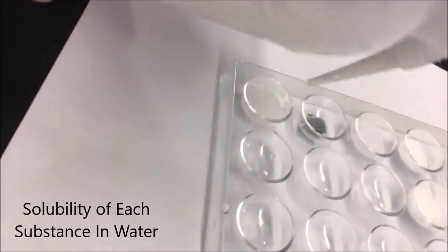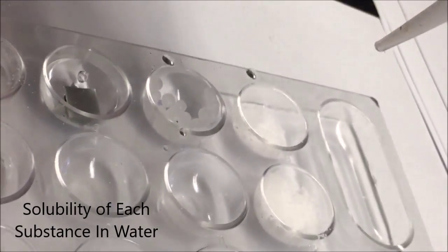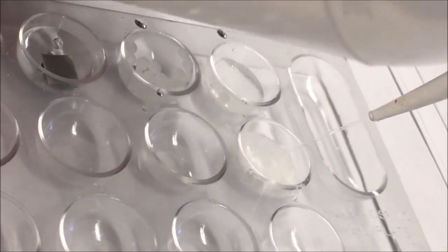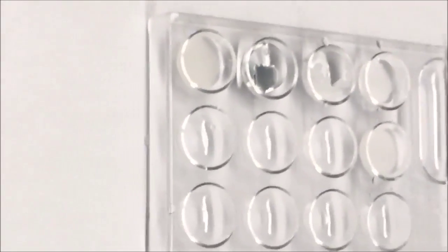In this experiment, my group placed several drops of water into each depression, then mixed in the substances with a toothpick in order to discover if the solids dissolve. The only solids that would dissolve were potassium iodide, table salt, and sucrose.